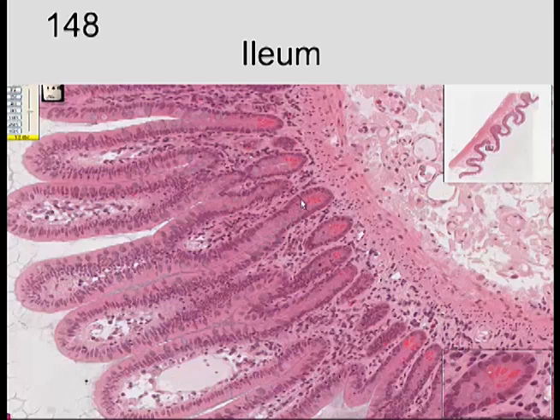At the base of these cells, you also have another type of cell. These are the Paneth cells. The Paneth cells secrete enzymes to kill bacteria that go in through there, and we'll learn about those later on. But right now we're concentrating on intestinal absorptive cells located right in through there. And here, throughout, we can see a little mitotic activity. These are metaphase plates associated with the production of new cells.